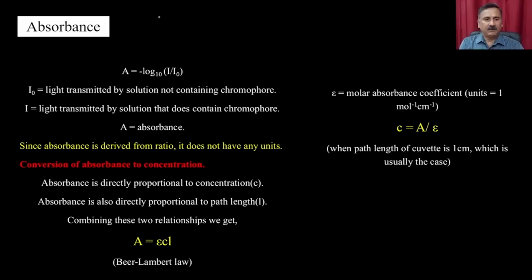That time we discussed how the absorption changes even with a slight modification of one group, or a substitution of a few more groups, right? So remember when we were talking about how the absorption phenomena changes when benzene is substituted at different positions and so on. So the second thing we have to discuss is the absorbance.